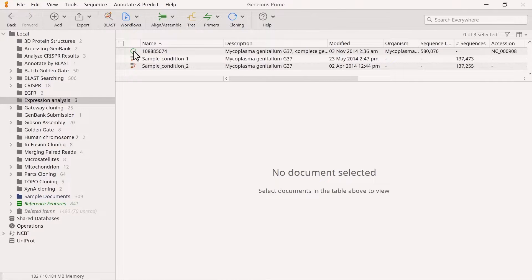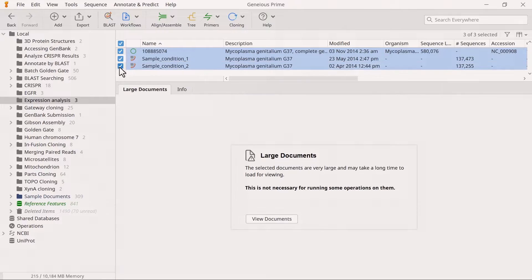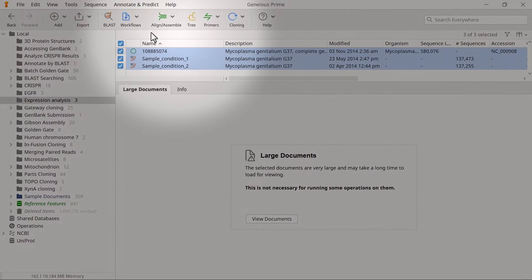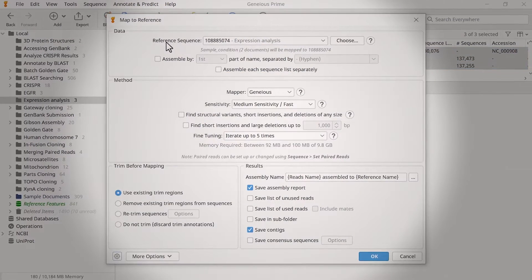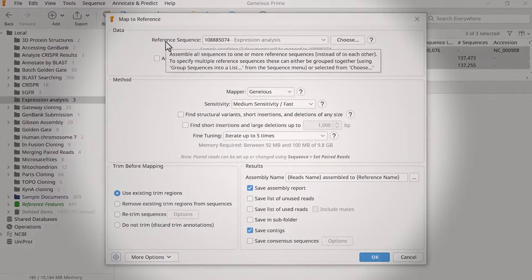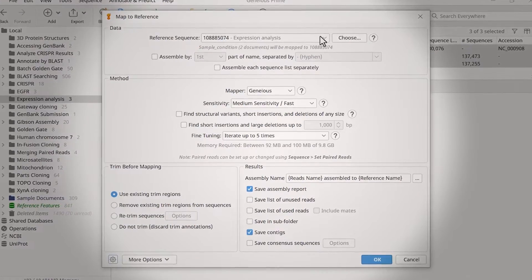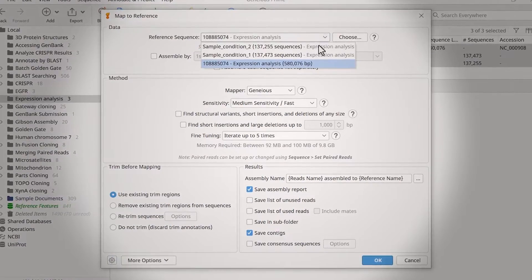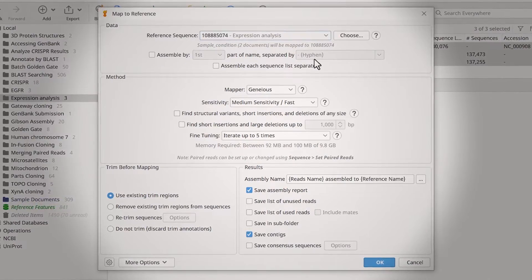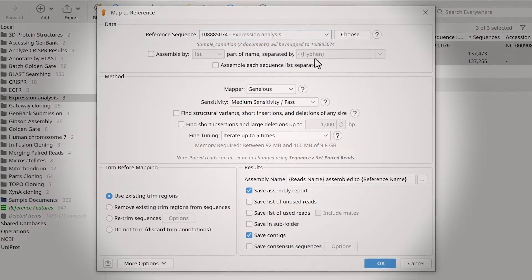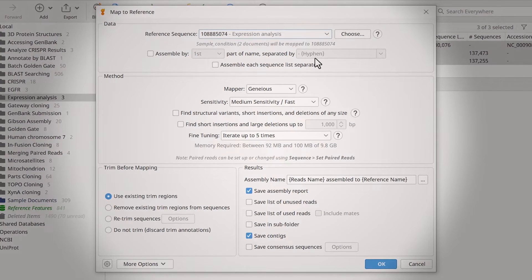To map the reads to a reference, select the reads and the reference files, then go to Align, Assemble, and Map to Reference. Ensure you correctly specify your reference sequence at the top. You can use the drop-down menu to select a different file in the same folder, or click Choose to select a file in another Genius folder.